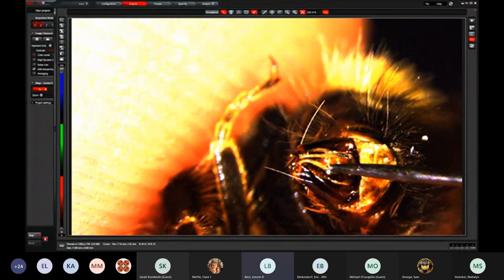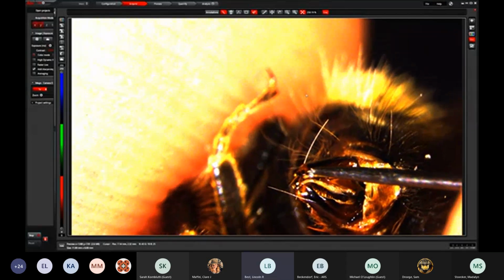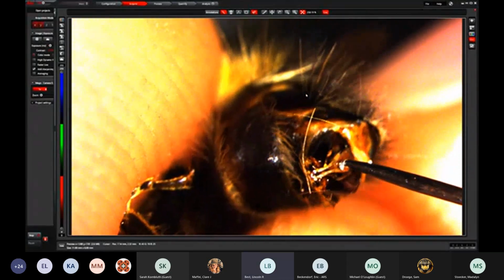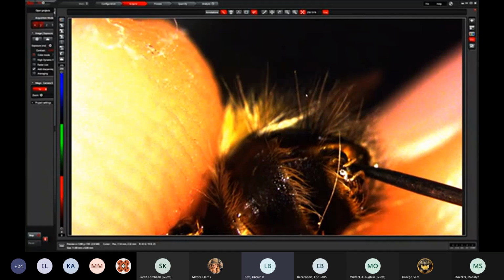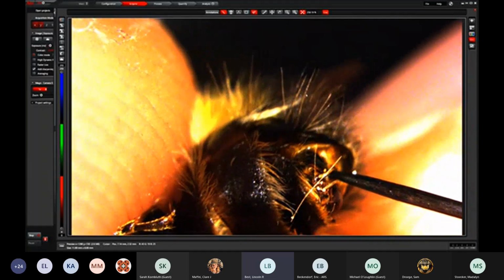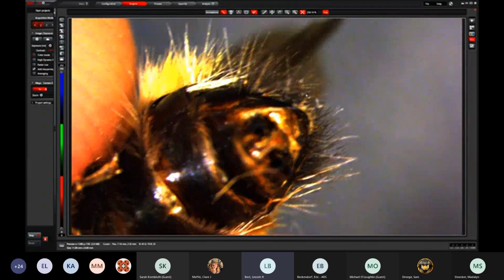They're not always white, but in this case, they look white. The penis valves, which are curved inwards apically. And so if you were to run this specimen through the key, with those simple volsella and the hooked inwardly simple penis valves, you quickly find out that this is a Pyrobombus.